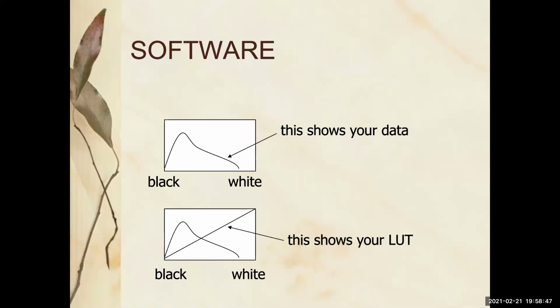Okay, so in software, again, this is what you will see. You'll see your data, in other words, the histogram of your image, and then you'll see a lookup table.